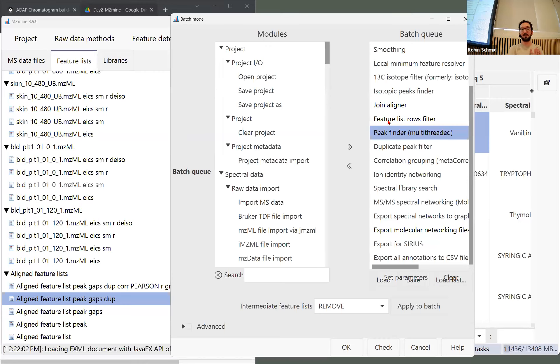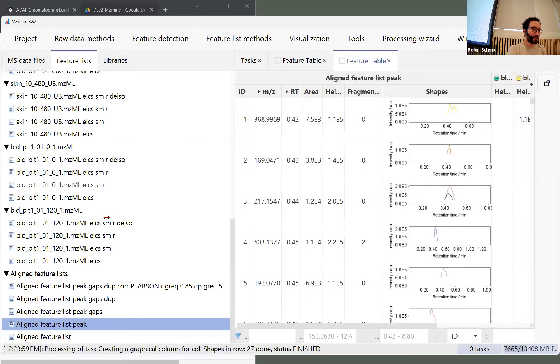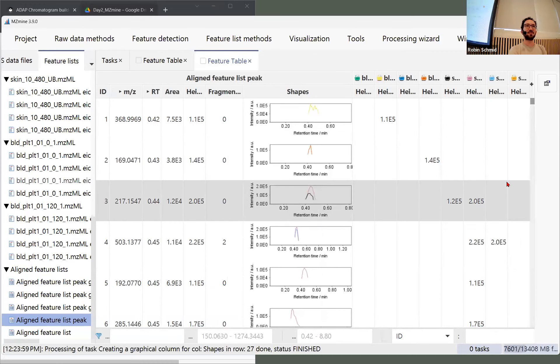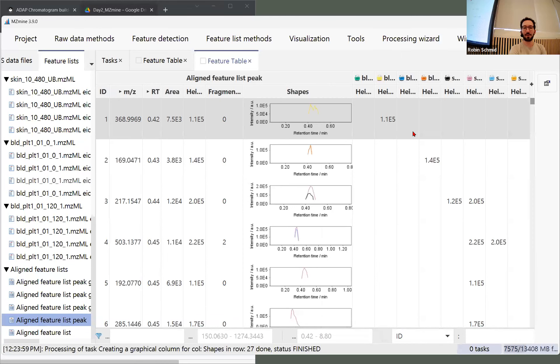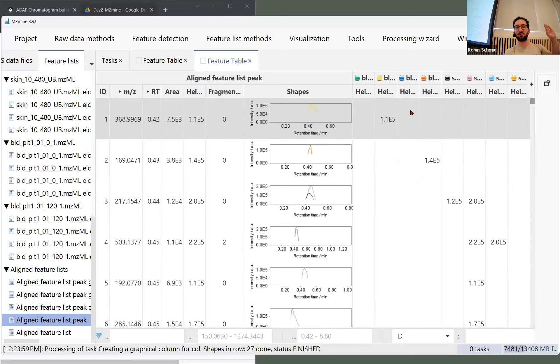Gap filling is a good secondary feature-finding step: we go back to the raw data, extract the m/z and retention time ranges from the feature list, inform the second round of feature finding, and try to fill in the gaps. Before gap filling we have the feature list with a lot of gaps — the question is always whether that's real or whether we just missed something.